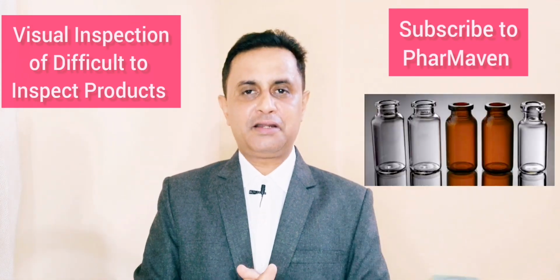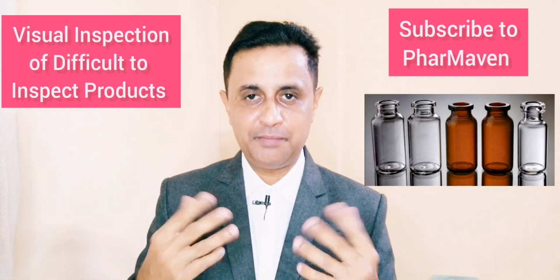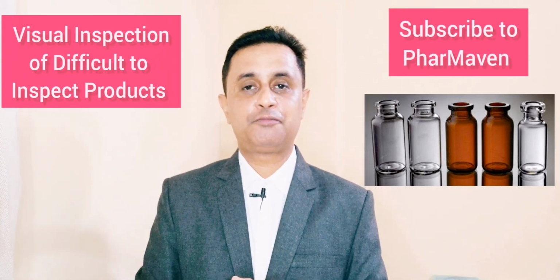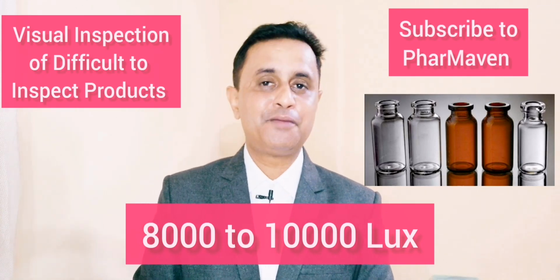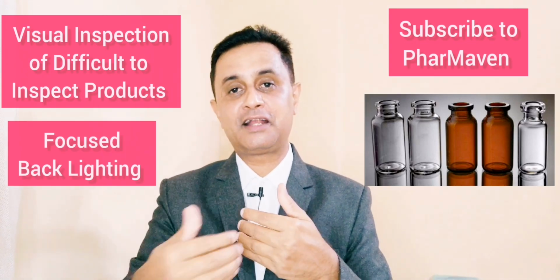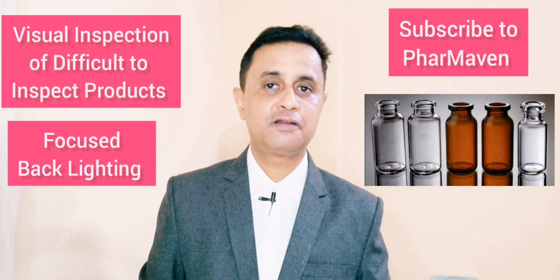Coming to amber color containers, amber color vials are designed so that they will not allow light penetration. So we may have to go for a higher lux level, ranging from 8,000 to 10,000 lux, for inspecting the amber color vials, as well as light just behind the container. An additional light source directed towards the container will facilitate easy inspection of amber colored containers.